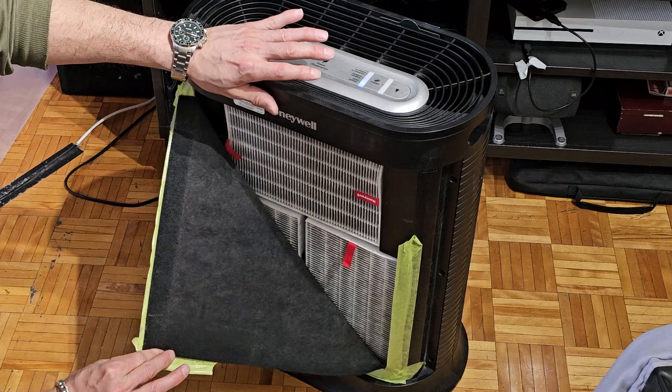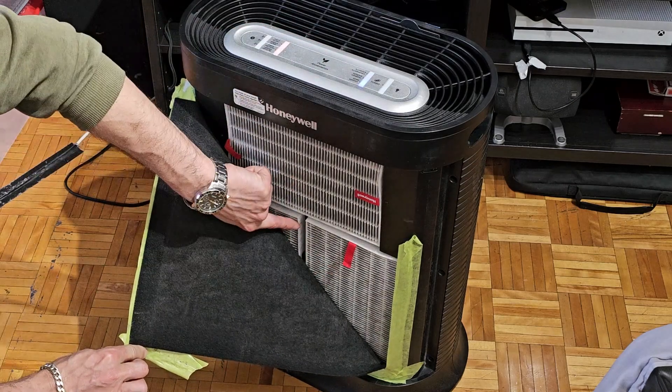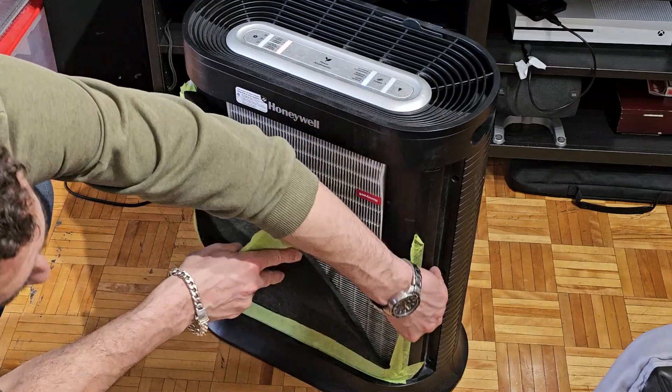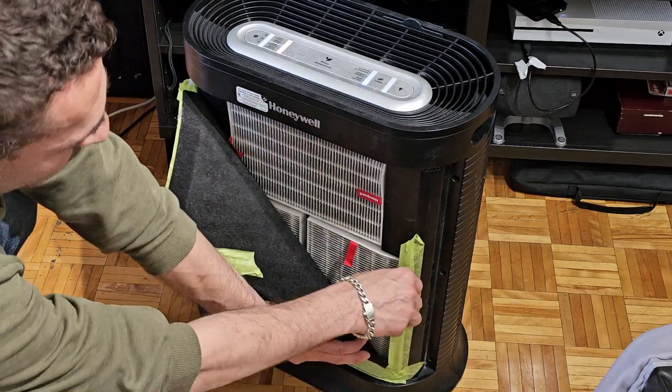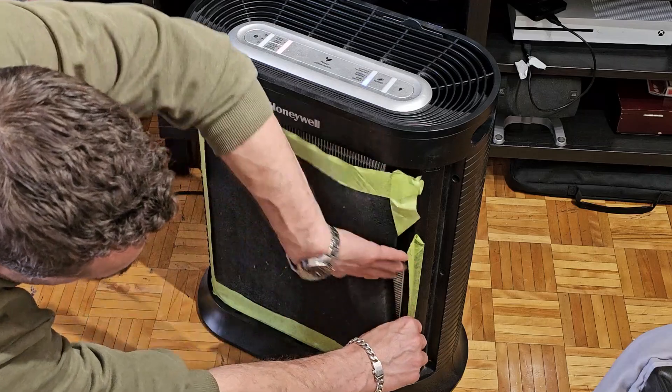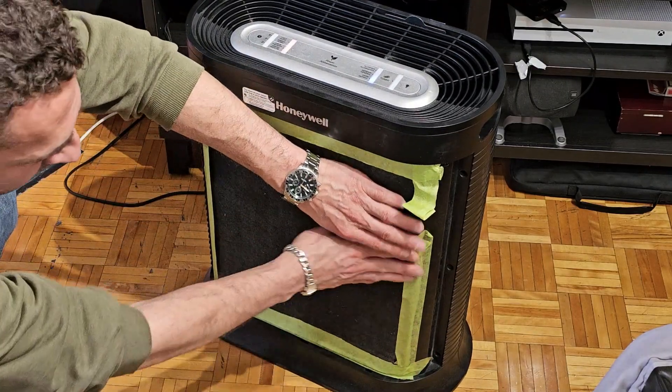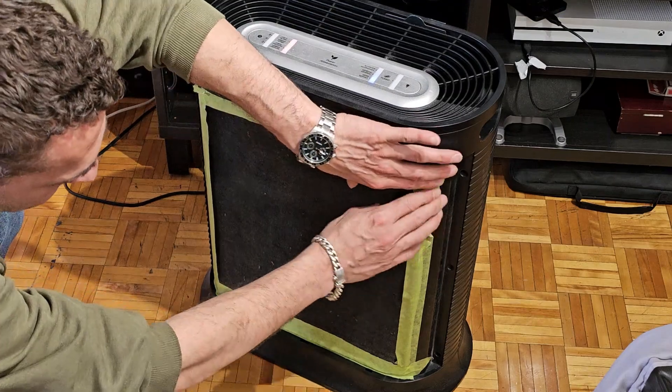Behind here, as you can see, there are three different replaceable HEPA filters. I've been running this for almost two years now without replacing them, and I'm still getting about a 99% success rate with all my cultures and transfers.